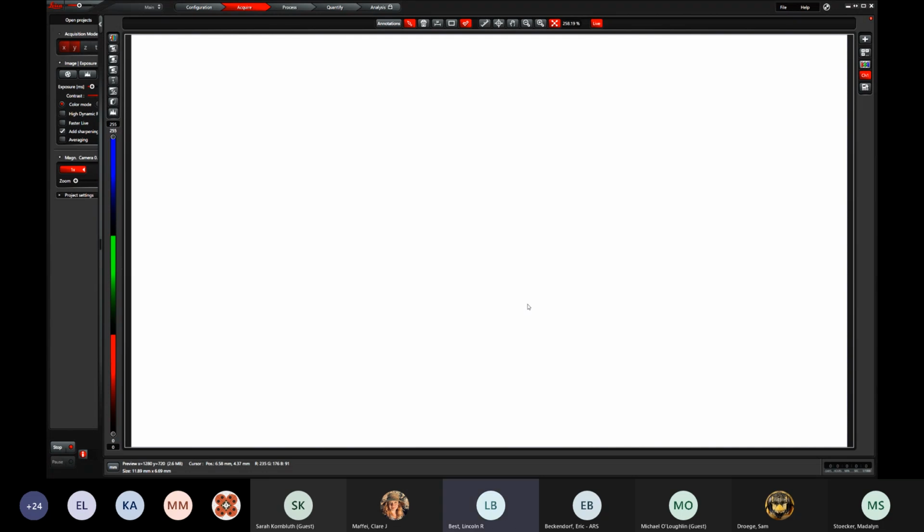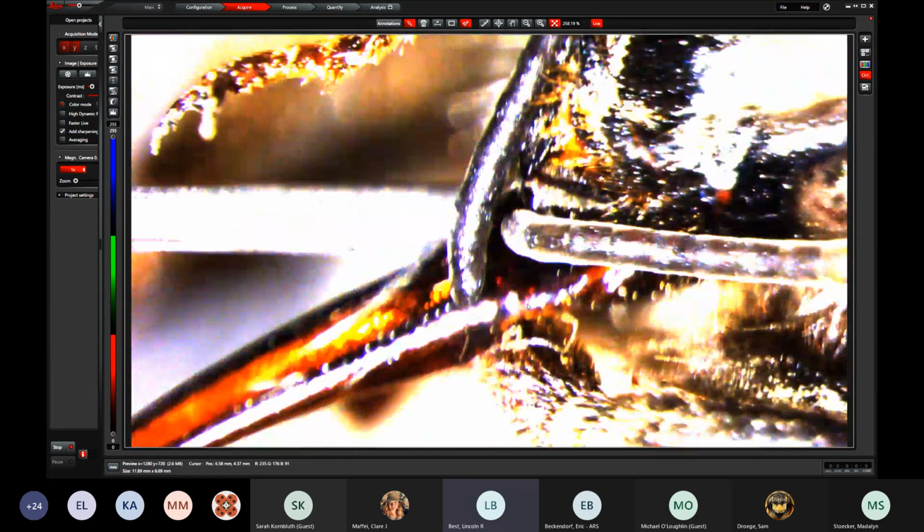So one of the advantages of collecting into ethyl acetate is that the bees almost always perish with their tongues fully exposed and their mandibles open. No, you can't see on that one.